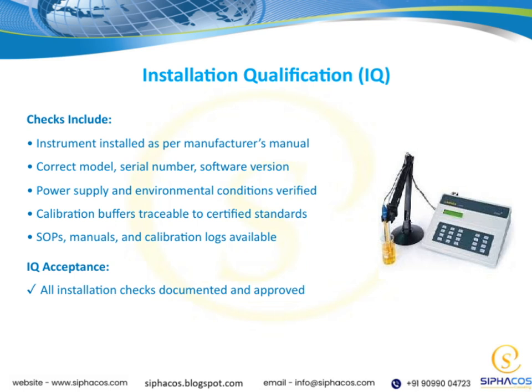This helps us confirm that everything is in the right place and properly assembled. Next, we check that the model, serial number, and software version match what was specified or ordered. This way, we avoid any mix-ups with equipment or outdated software.